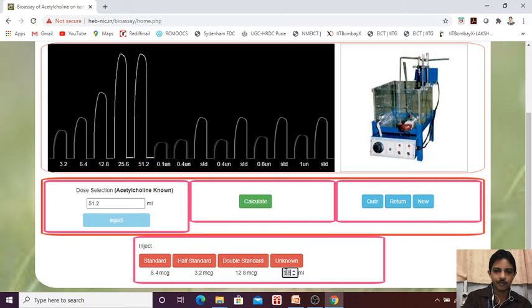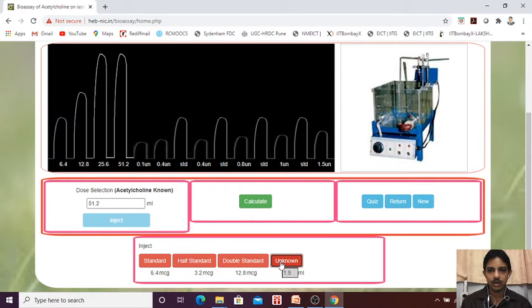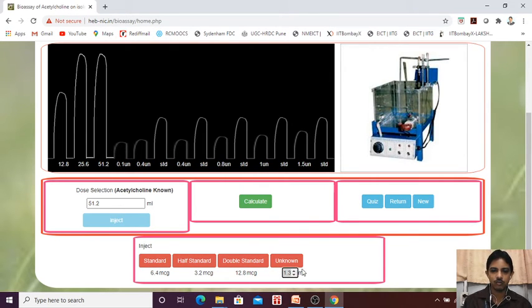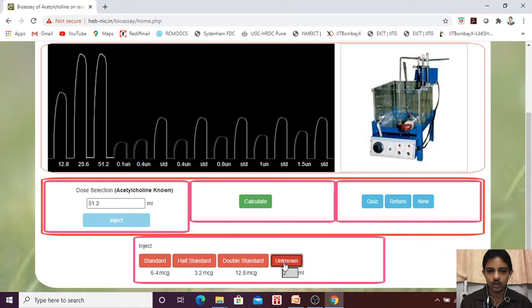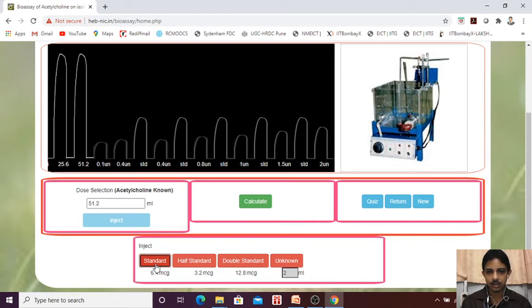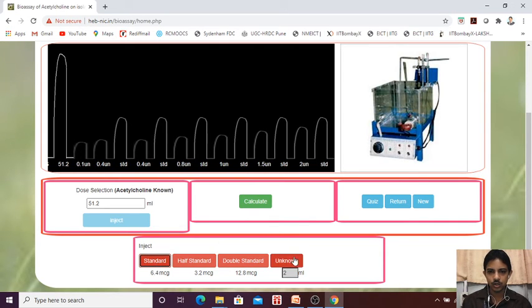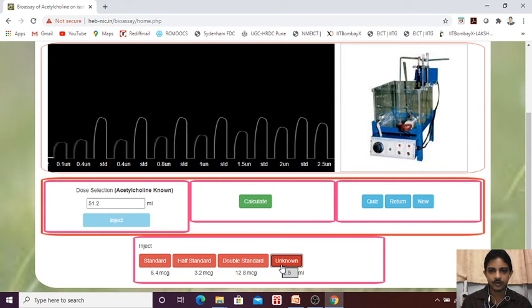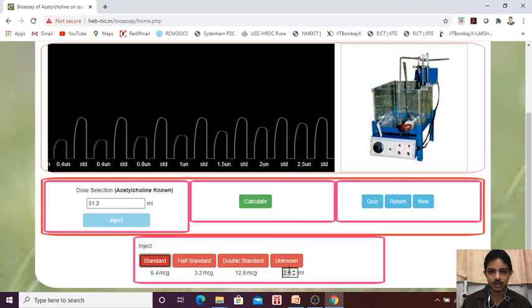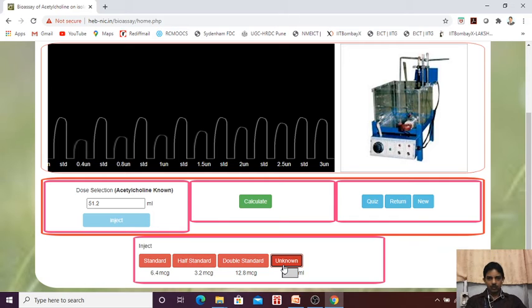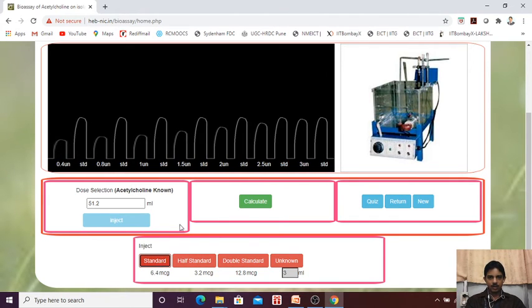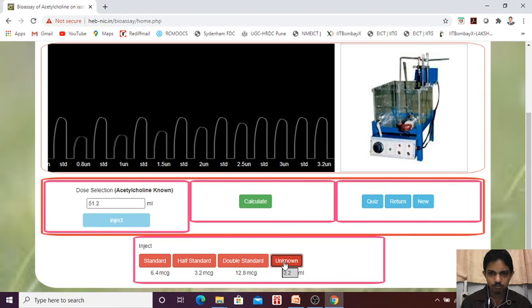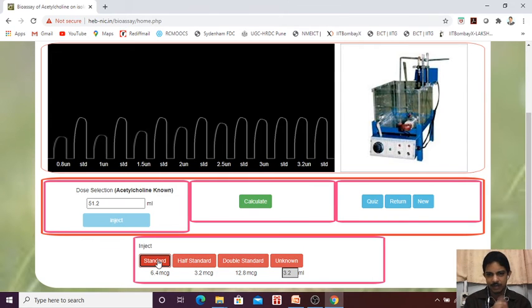Now 1.5. Again standard. Still you can say that the response is less, so we will take it for 2. Unknown is 2. Still. So we will give it 2.5. Let's see. No, still it is lesser. We will go to the 3. Whether it is matched. I think we required more, 3.2. If we are giving, maybe it is similar, maybe. For example, if it comes more, then what you need to do?